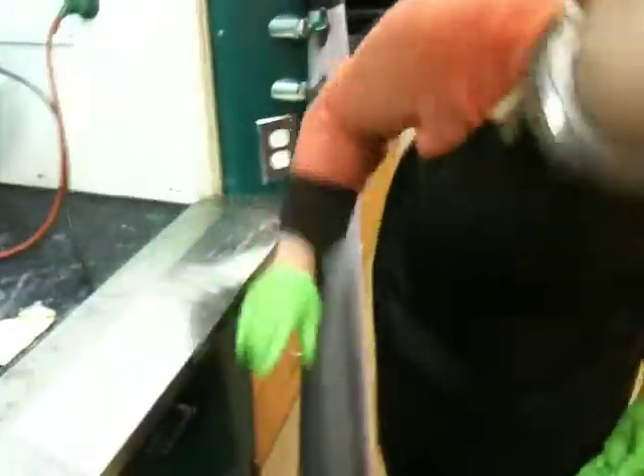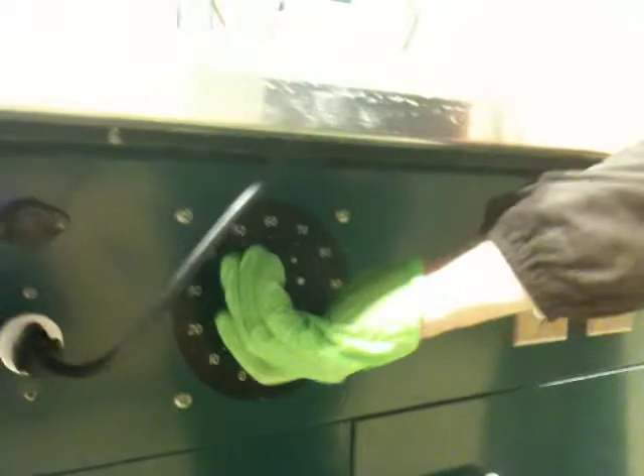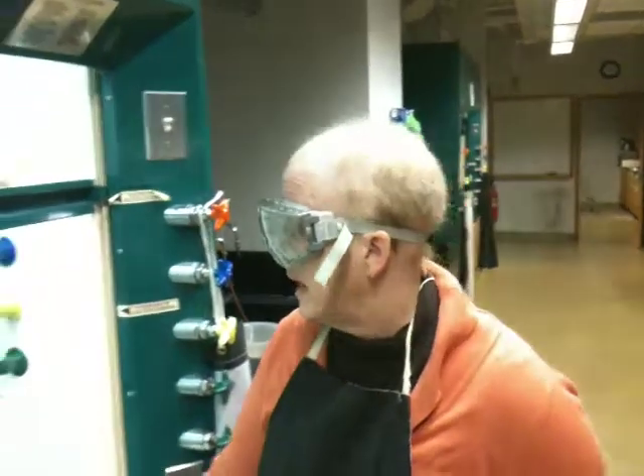The other way you prevent fire is by keeping the heating setting at the level that's suggested in lab. If you feel like you're in a rush and think you'll turn it way up, don't do that. If your instructor says to set it at 80, set it at 80. If they say to set it at 60, set it at 60. If they say to turn it up, turn it up. The reason we're really strict about this is if you do overheat a liquid, you can cause a fire.